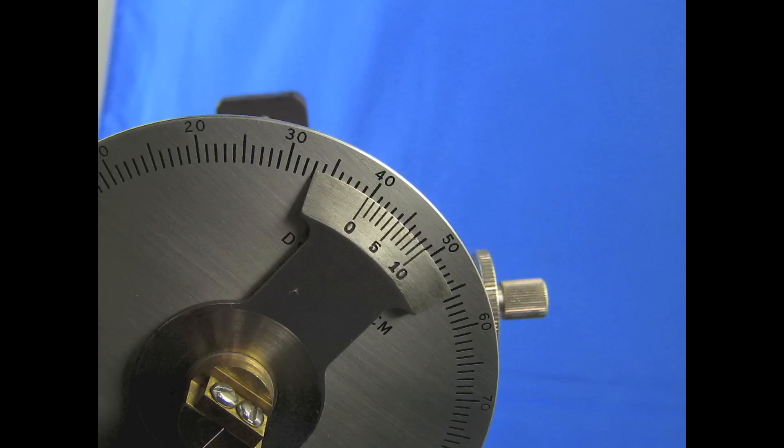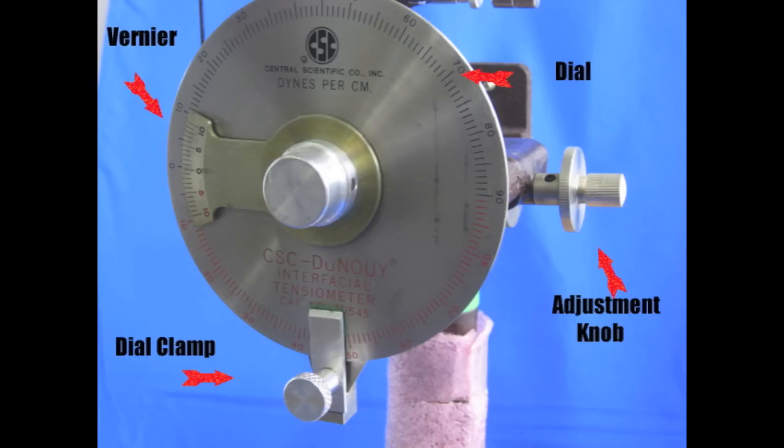This process changes the arm length and the zero point. You now must re-zero the tensiometer and redo the calibration steps.